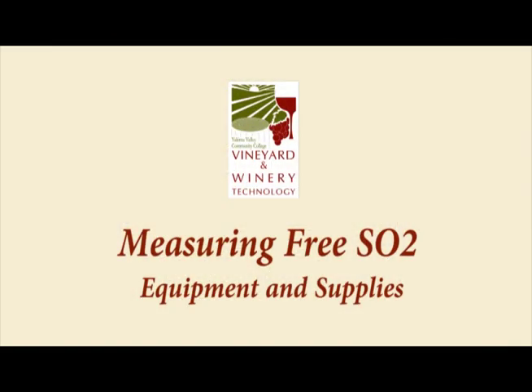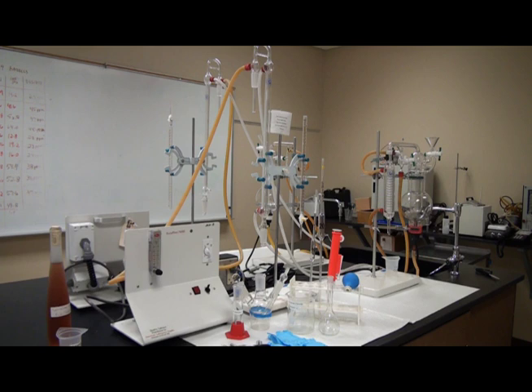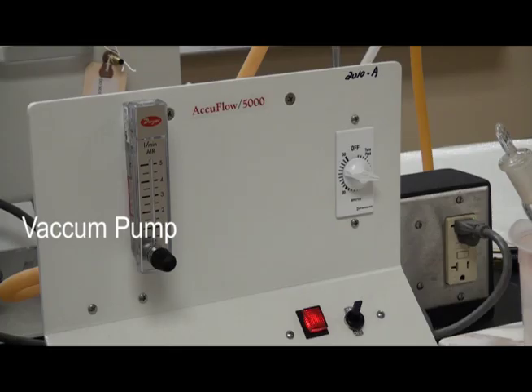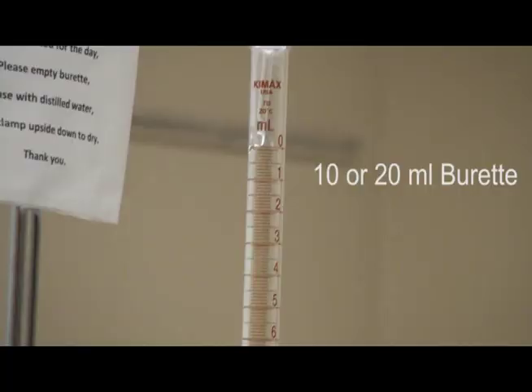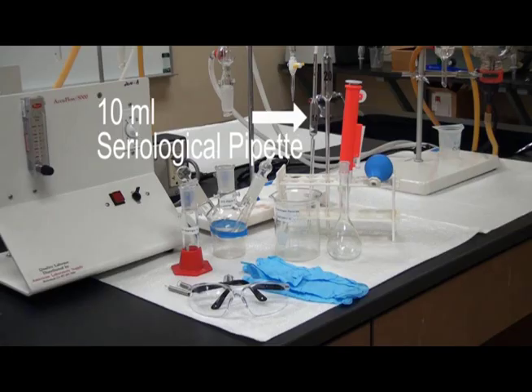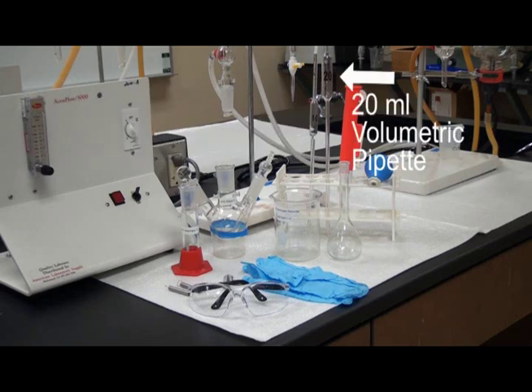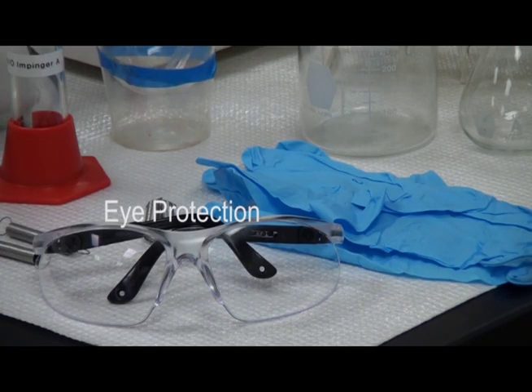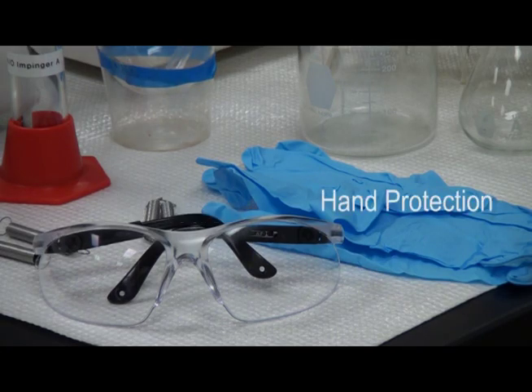Equipment and supplies needed for this analysis include aeration oxidation apparatus with the flow meter, a vacuum pump, a 10 ml burette, a 10 ml serological pipette, a 20 ml volumetric pipette, pipette safety bulb, safety glasses or goggles, and safety gloves.